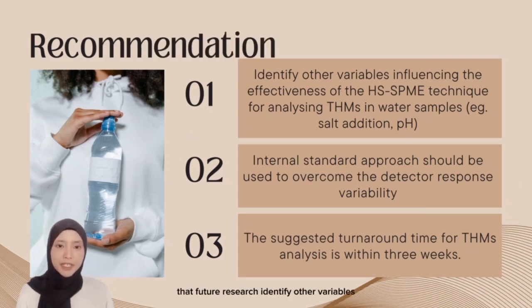It was recommended that future research identify other variables influencing the effectiveness of the headspace SPME technique for analyzing trihalomethanes in water samples, for example, salt addition, pH, and many more. In order to obtain more accurate quantification of trihalomethanes in samples, an internal standard approach should be used since it can overcome the detector response variability compared to the external standard approach.